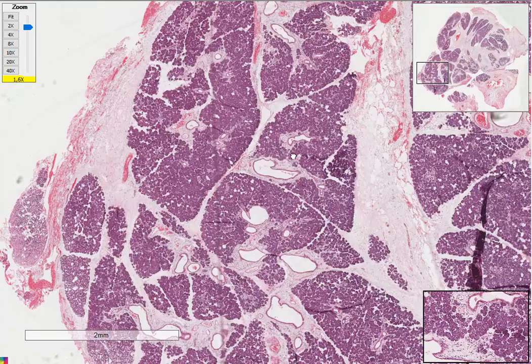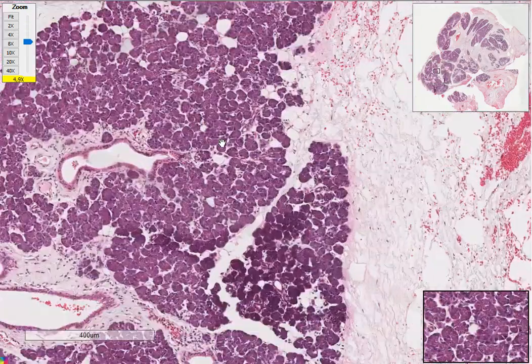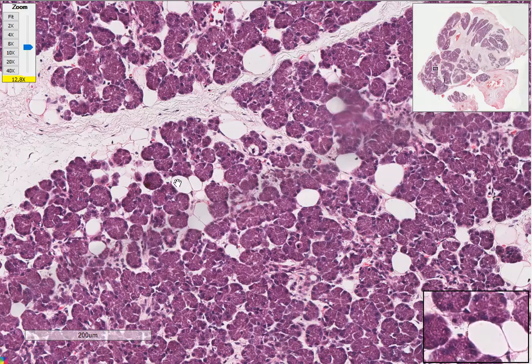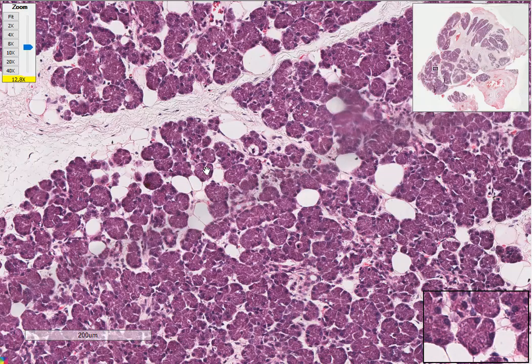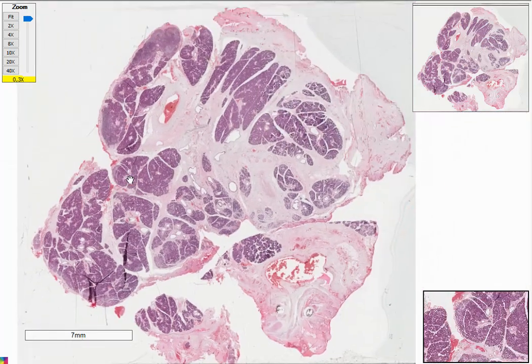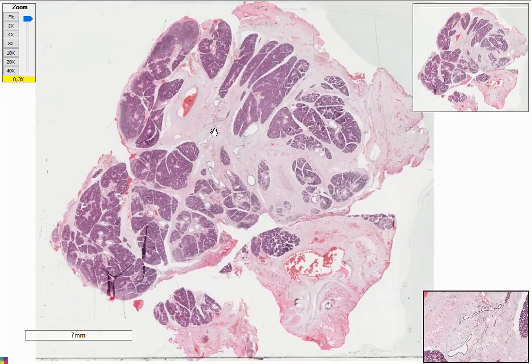And if you notice, you also see a few adipocytes within the salivary gland. You can see this is an adipocyte there. So that's about the parotid gland. Remember, this is a serous gland. Okay, now we can move into the submandibular gland.